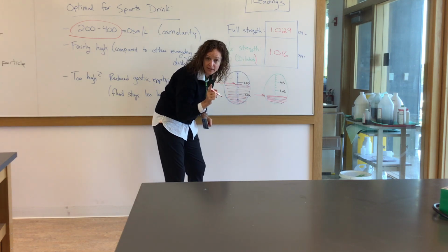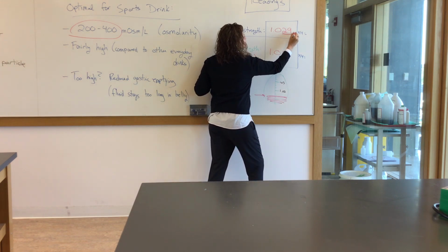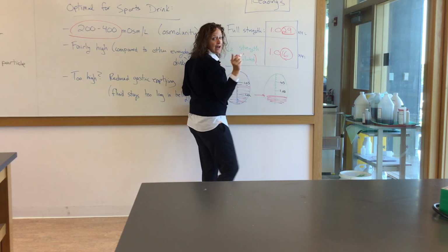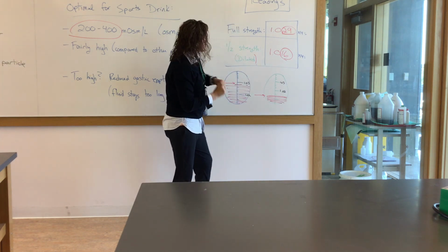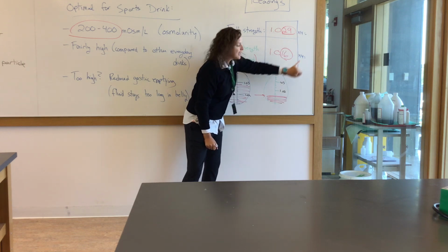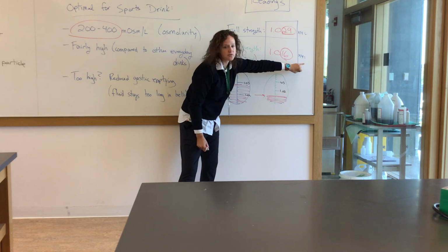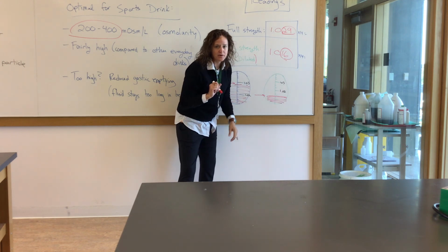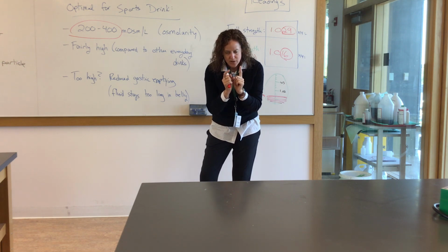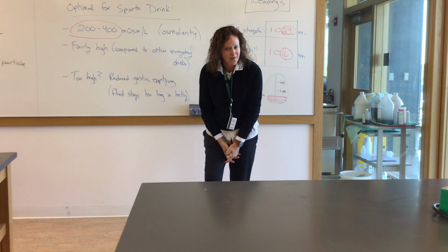Now for your calculations, you only need the last two numbers, 29 and 16. To calculate your osmolarity, multiply 29 times 14. And then for the half strength or diluted, 16 times 14. That'll give you the number. Again, we want to see, does it fit into the optimal range, which is 200 to 400 milliosmoles per liter. All right, well done, folks.